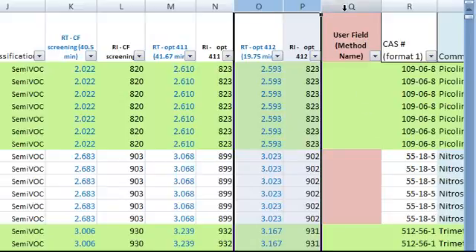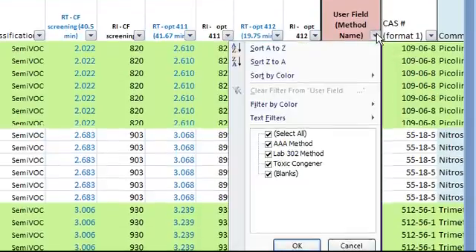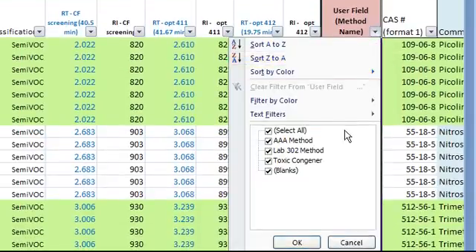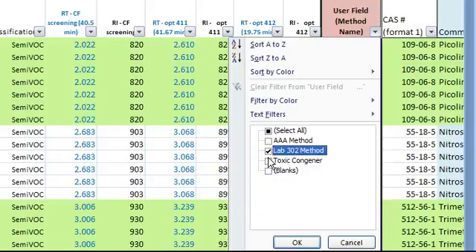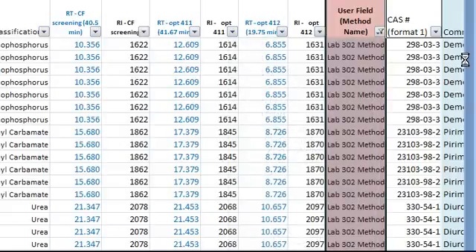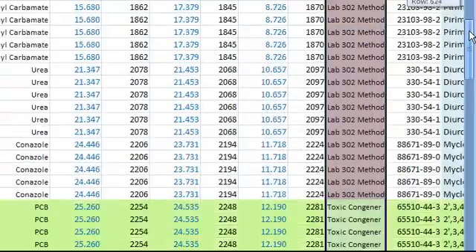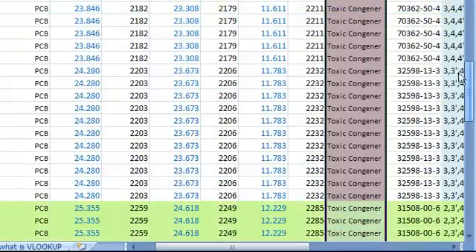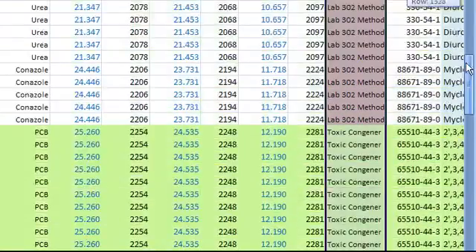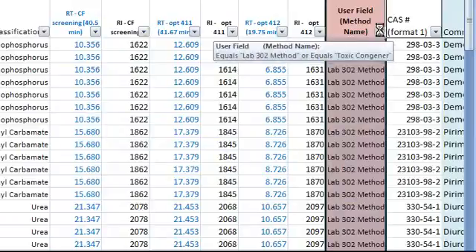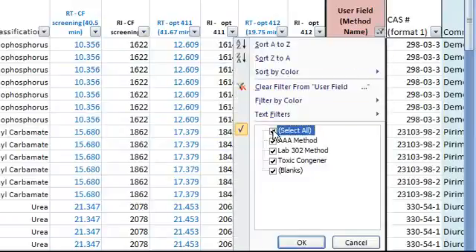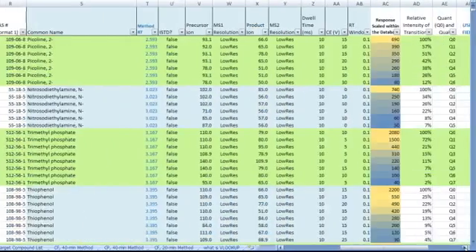The next column is the user field, which you can use to pull out compounds from the database you want to analyze, based on a specific method or a project. Currently, we have AAA method, lab 302 method, and toxic congener method in this column. Let's just select two of the three methods and see what we get. Now, the database shows just the lab 302 method and the toxic congener method. You can use this filtering function to quickly select a method to build an acquisition method, based on the compounds in the method selected. Let's select all of them back and continue to discuss the other columns in this database.